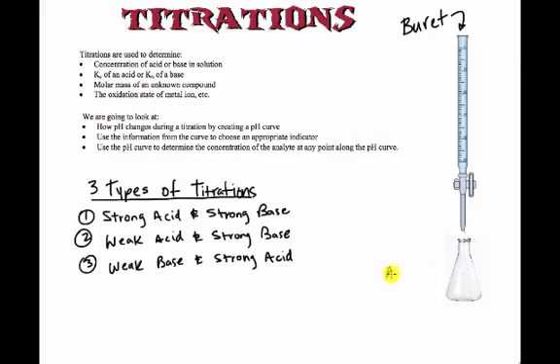So this down here is what we would call our analyte, because it's what's being analyzed, and up here would be called our titrant, because it's the substance that we're using for the titration. So that would be our titrant. Alright, so what do we do with these?